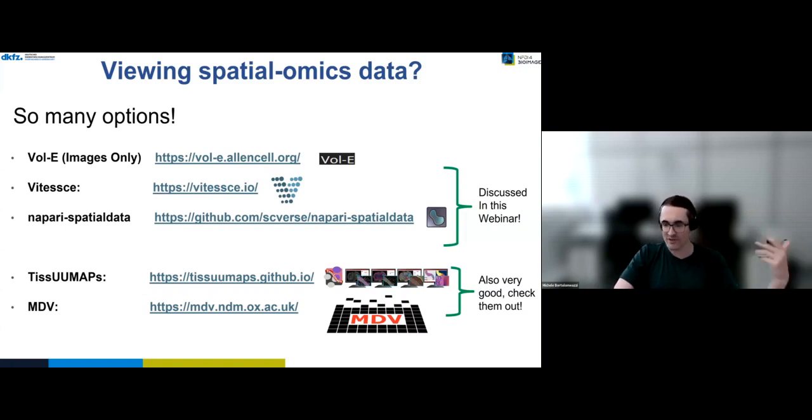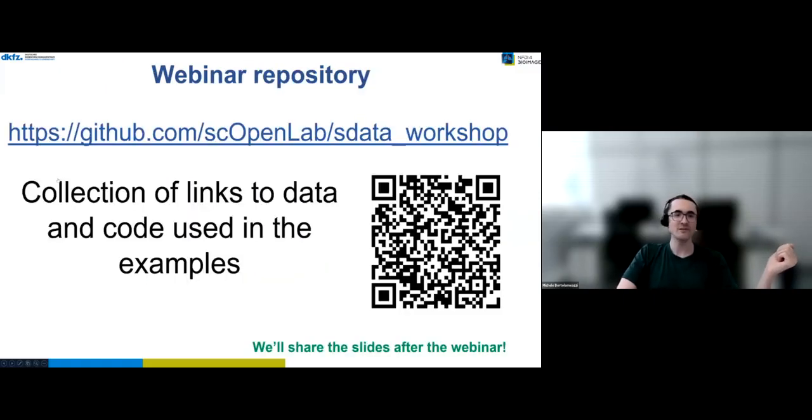They also have their own example datasets that you can play around with and see if this could be the right tool for your project. I would like to show a lot of examples, but of course, the best thing is really when you can try things out for yourself.